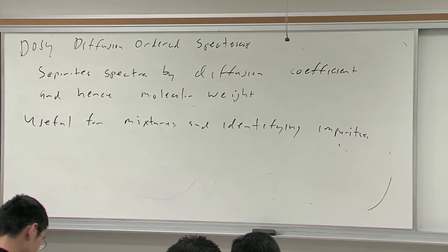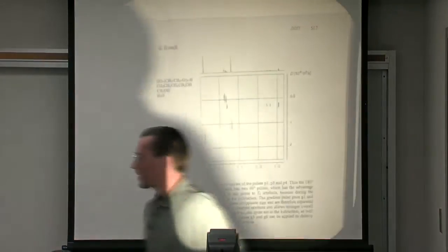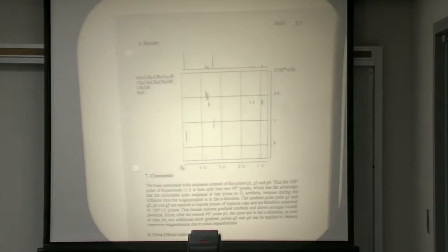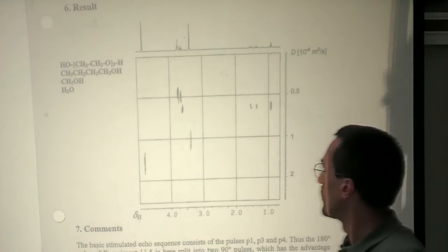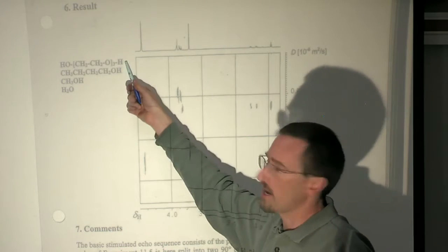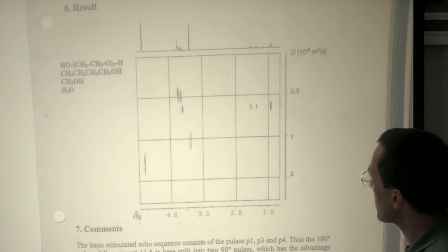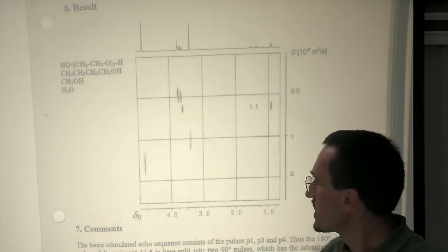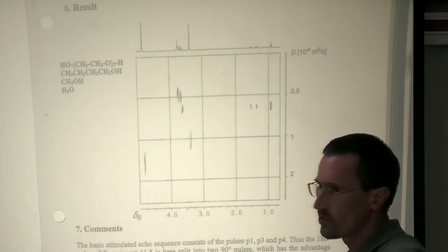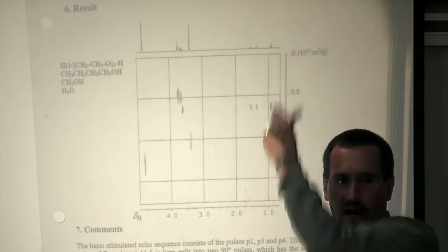And this is an example out of that 200 and More NMR Experiments. So this is a DOSY spectrum in your 200 and More NMR spectra of a mixture of two different molecules, butanol and triethylene glycol in two different solvents. And what you're doing is using pulse field gradients to separate your molecules by diffusion coefficient. Basically, little molecules like water and methanol diffuse rapidly.